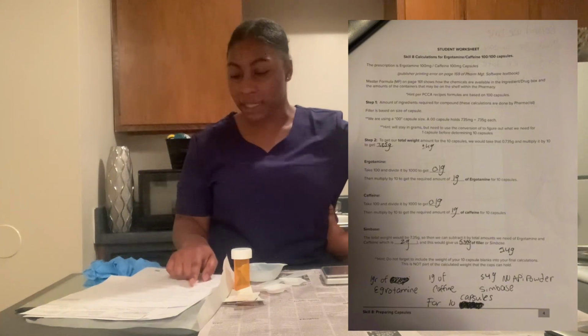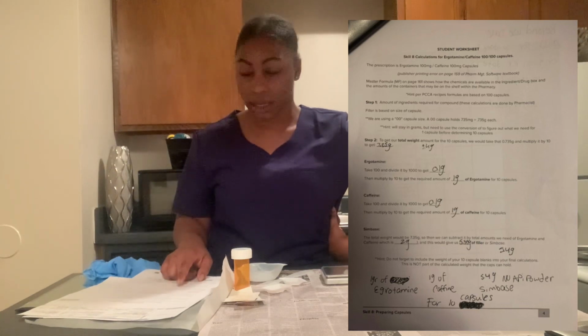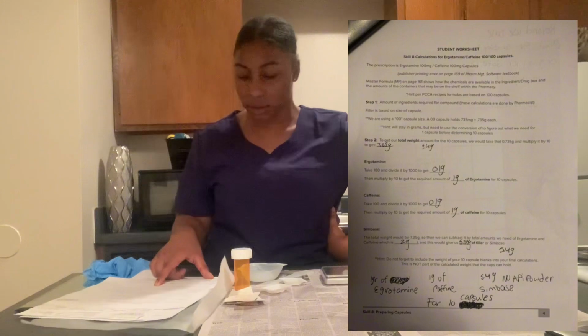Then multiply by 10 to get the required amount of 1 gram of ergotamine for 10 capsules. Next is the caffeine. Take 100 and divide it by 1,000 to get 0.1 grams. Then multiply by 10 to get the required amount of 1 gram of caffeine for 10 capsules.